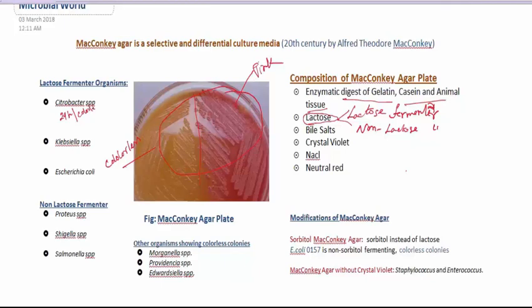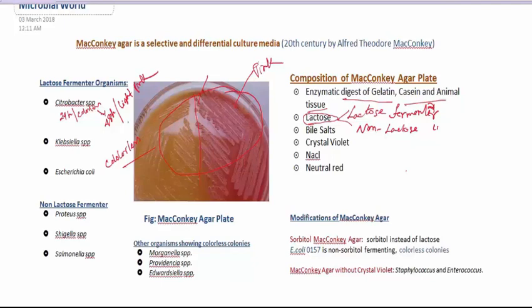For example, if we grow Citrobacter species on MacConkey agar, after 24 hours of incubation we see colorless colonies — meaning Citrobacter can't break down lactose at that time, so we would consider it a non-lactose fermenter. However, if we observe the same plate after 48 hours, we see light pink color, meaning they can ferment lactose after 48 hours. This is the characteristic of Citrobacter species.